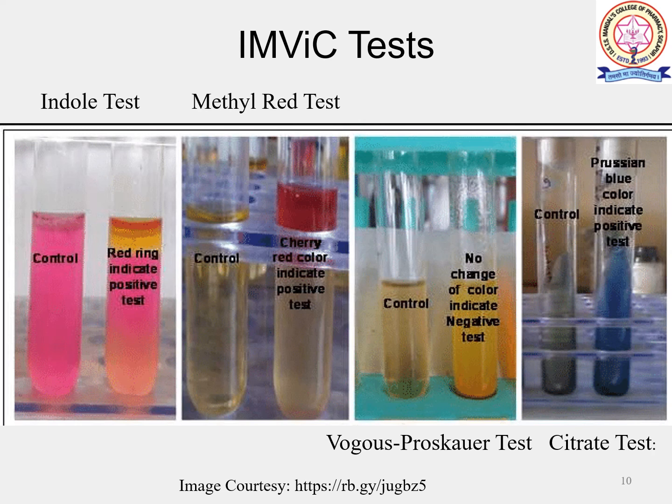Here we can see the red ring at the top. So this indicates that the indole test is positive for that organism. If there is no ring, then it will be negative. Then comes the methyl red test.